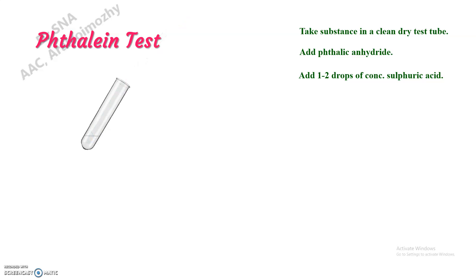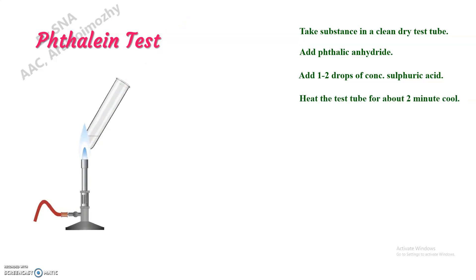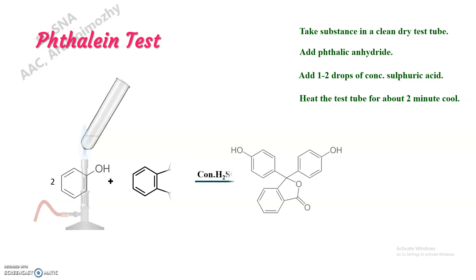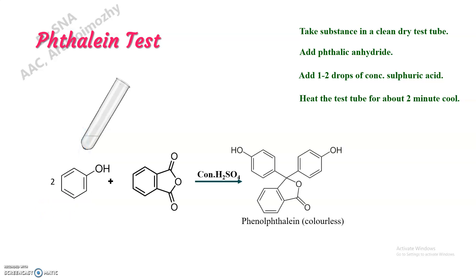Now we can heat it for just 2 minutes. After heating we can cool it. In this reaction we are getting phenolphthalein dye, which is actually colorless in acidic medium due to its benzenoid form.